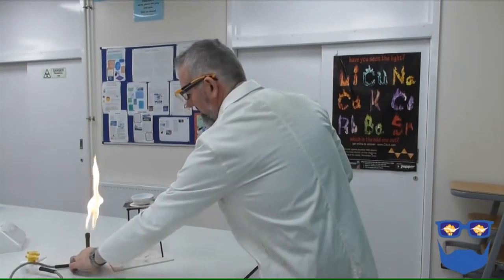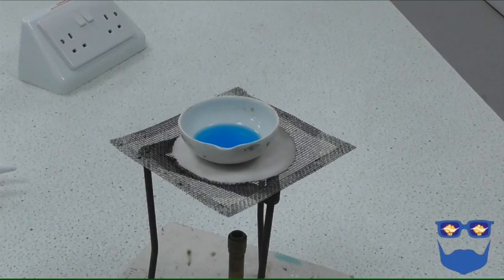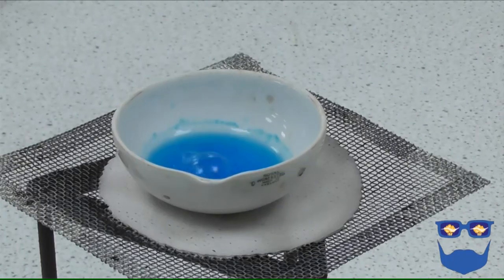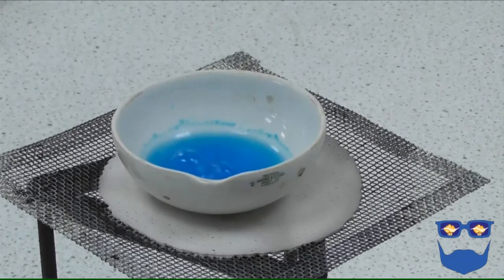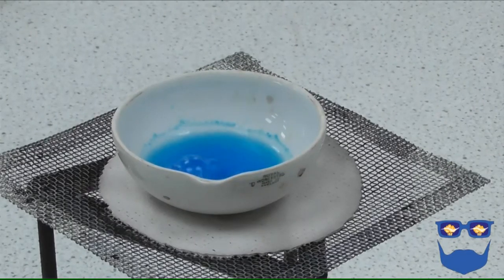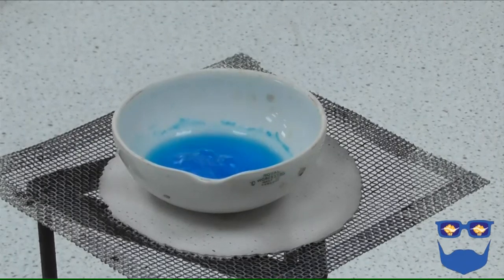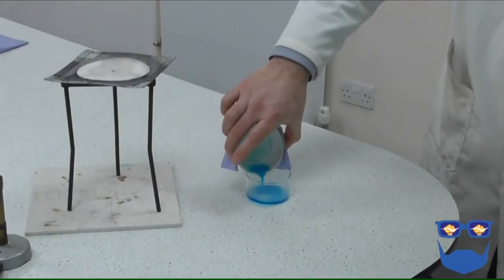Stage 3: purifying part 2 and crystallisation. Place the evaporating basin on the tripod and heat the solution. We are trying to evaporate most of the water — continue until you have evaporated between half and two thirds of the volume. Turn off the heat. You could use a water bath at this point; it takes longer but is safer as the temperatures used will be lower. As the water evaporates, the concentration of the solution increases and the number of particles of copper sulphate to water molecules increases. We are looking for the saturation point or crystallisation point — the point when the water can no longer dissolve any more substance. Carefully pour the solution into a petri dish and leave in a warm place, maybe a windowsill.